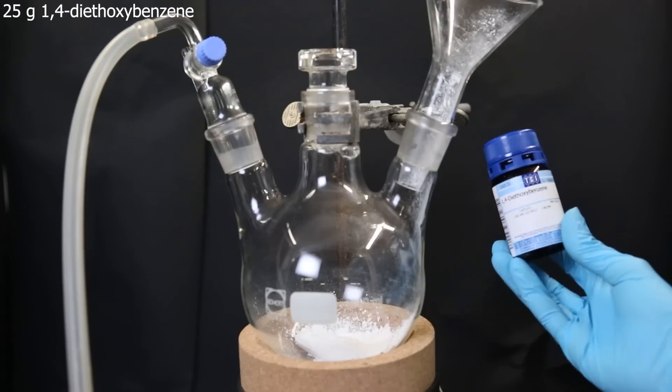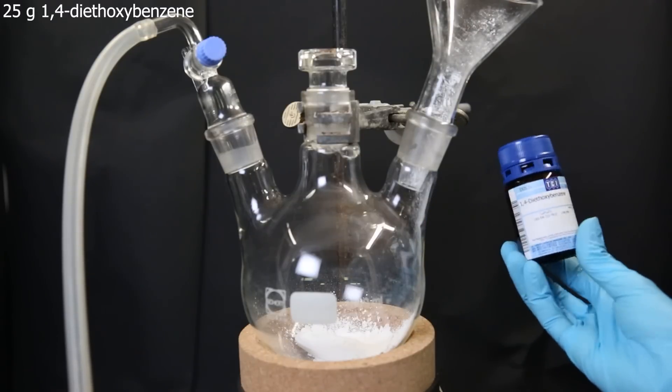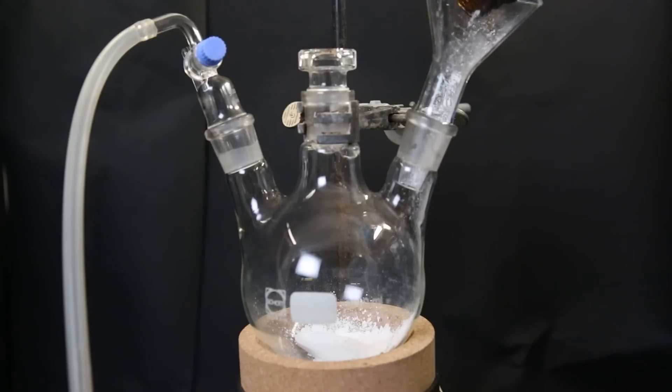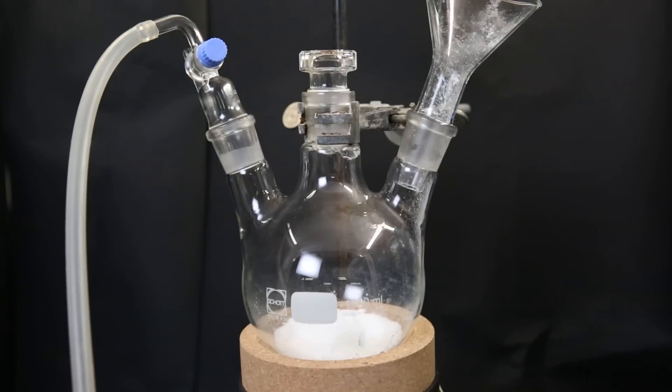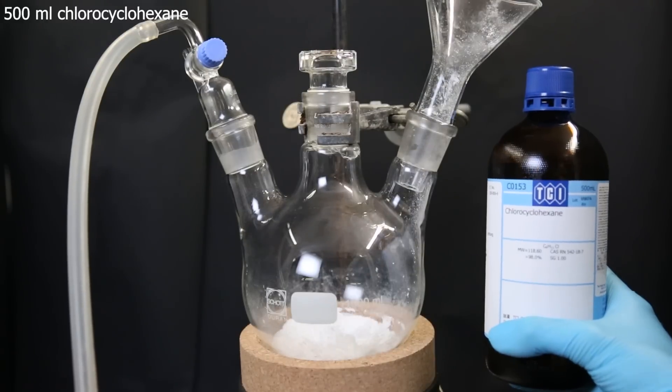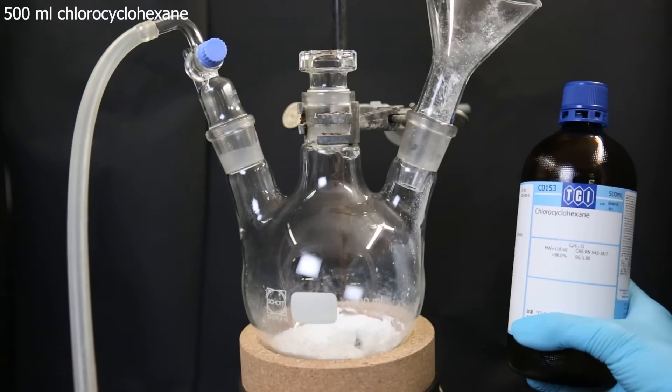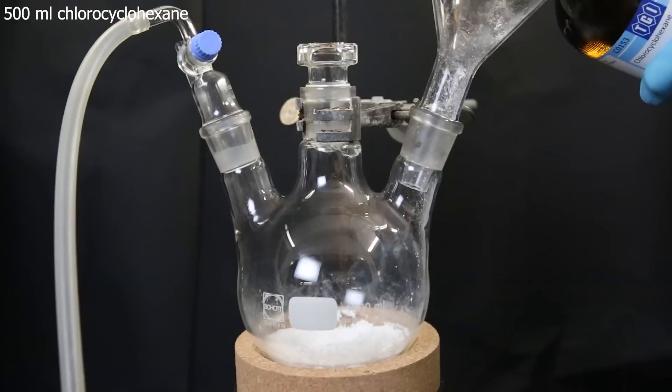Then I will add in 25 grams of 1,4-di-ethoxybenzene, which is the whole bottle. Now I will add in 500 ml of chlorocyclohexane, which is also the whole bottle.